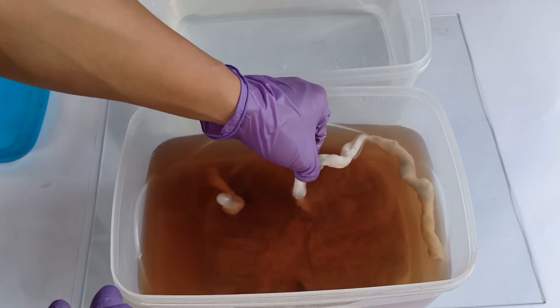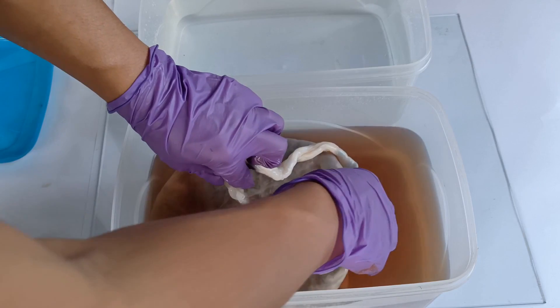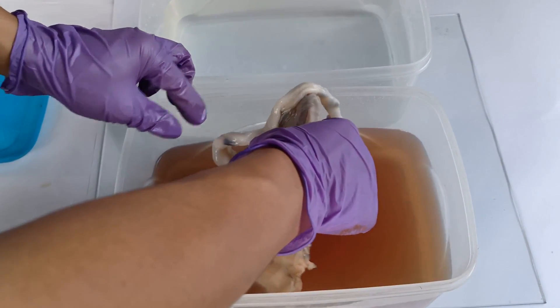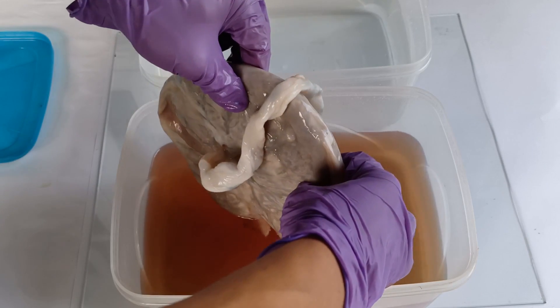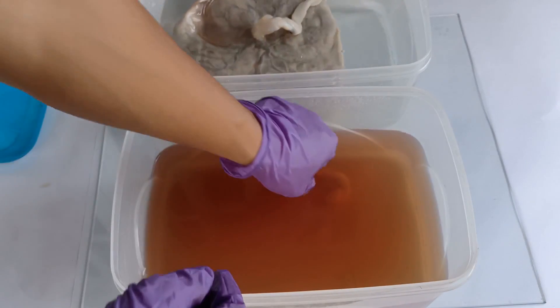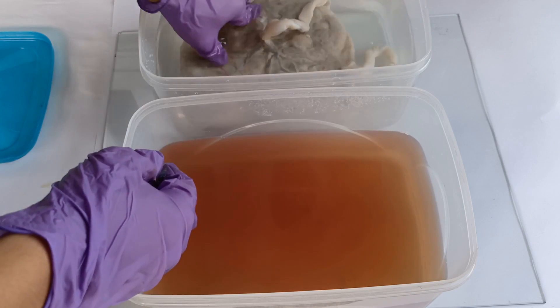At the end of the week-long fixation process, remove the placenta from the formalin fixative and give it a brief rinse in clean tap water for a minute or so. This will further get rid of residual blood-tainted fixative from the surface of the placenta. If the placenta is to be preserved in formalin, follow this brief rinsing step and proceed to the next step, which is final preservation and display.